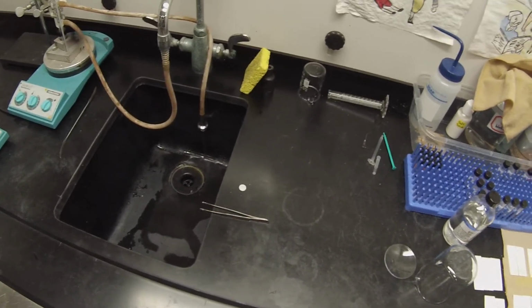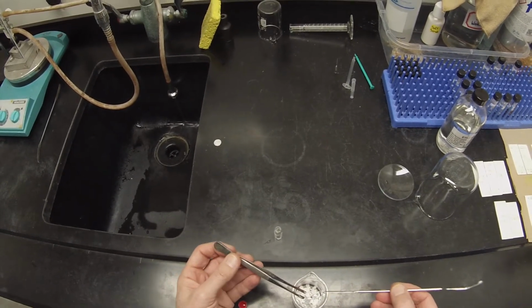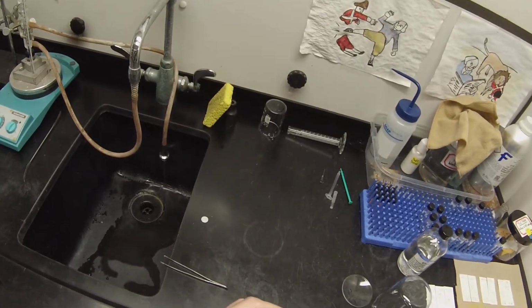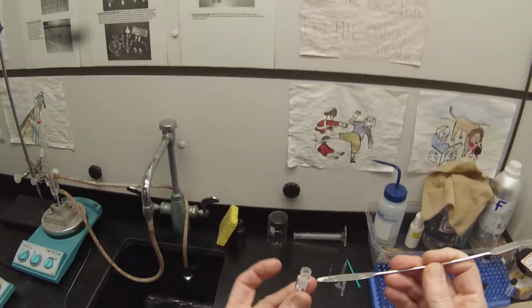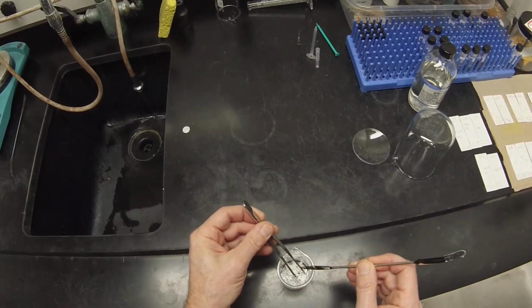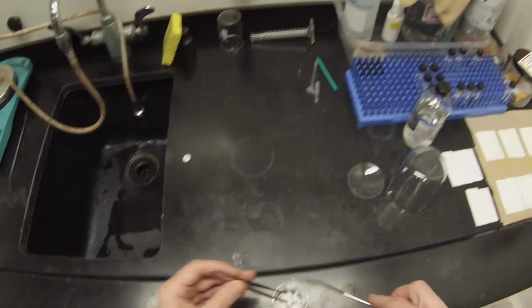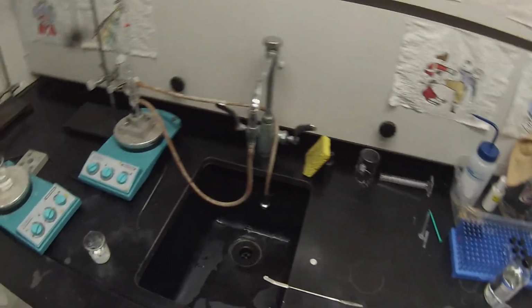That's way too much. That is sticky. Shoot. Try to smear it in the vial. That should be plenty of solid for a mass spec. Solid is definitely not dry. But it doesn't need to be for a mass spec because the water won't interfere. So we'll just save that for later for making up the mass spec sample. I wouldn't be shocked if the yield's a little high here, since clearly that solid is not dry, even after 2 full days sitting in the desiccator.